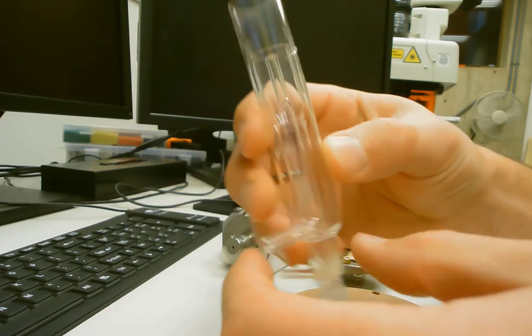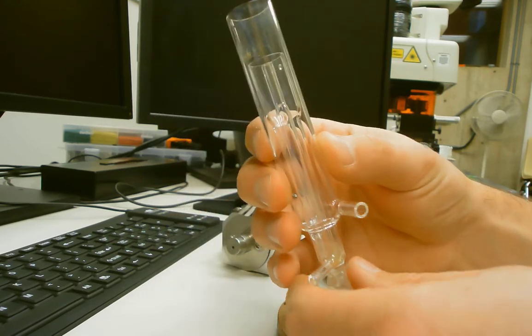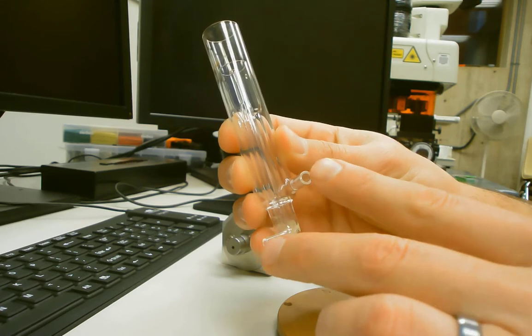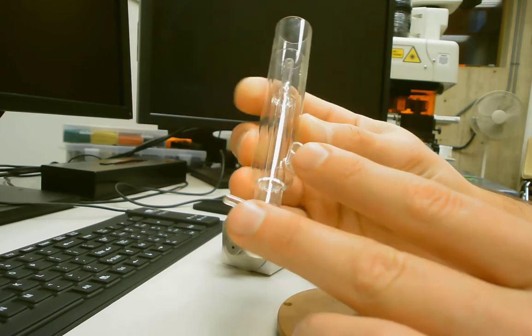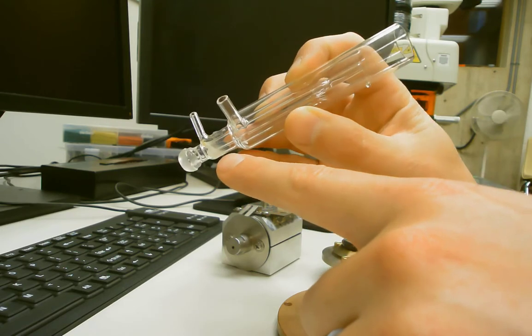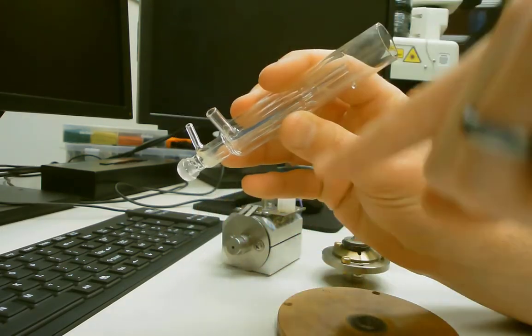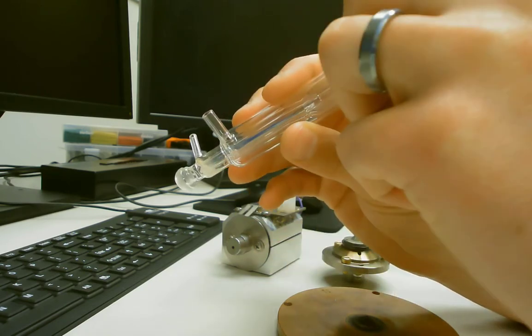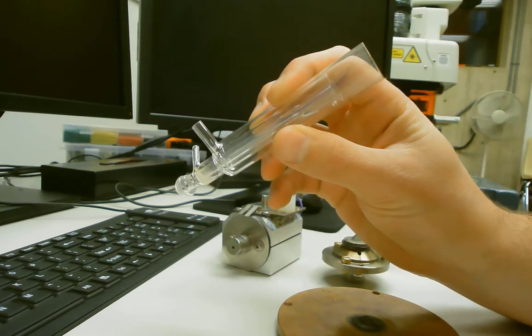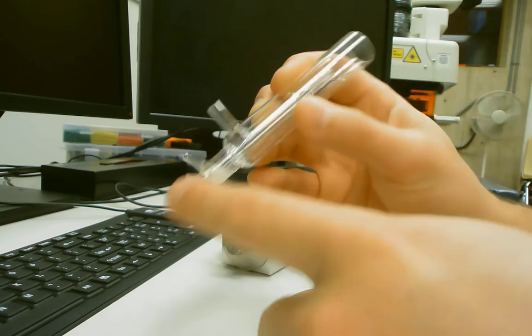So the first thing that we can show you is the quartz torch. This is the plasma torch. Here are the two ports where the argon was input, and you can see that the way it comes in, they kind of form a little vortex. They come in at an angle, so they cause a swirling motion, which will help confine the hottest part to the center. So there's two different ports there.